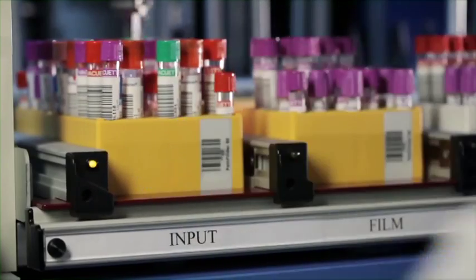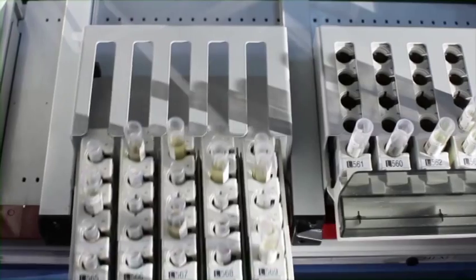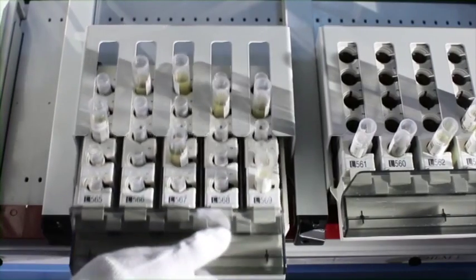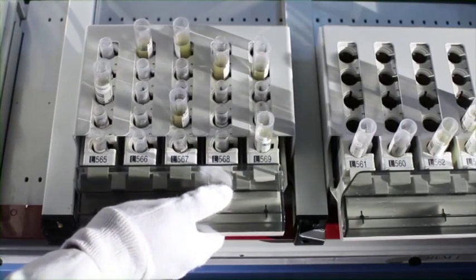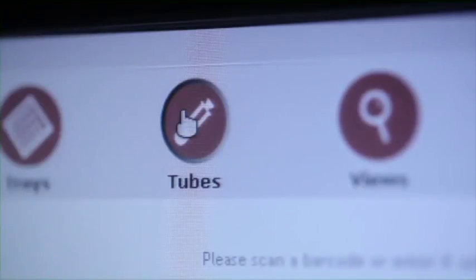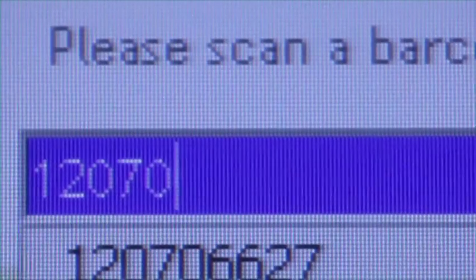Automating these tasks increases productivity by optimizing the workflow in the laboratory, by decreasing sample turnaround time, and by reducing the incidence of lost or misplaced tubes.